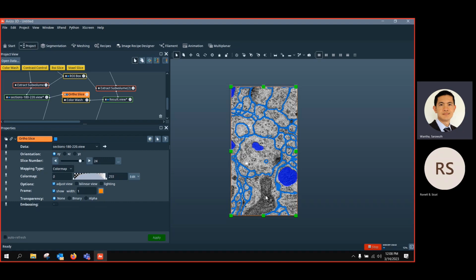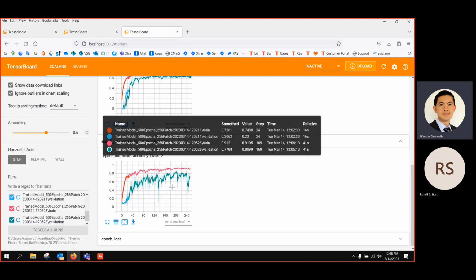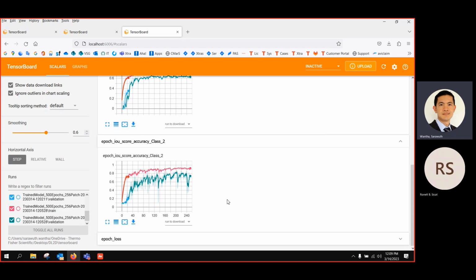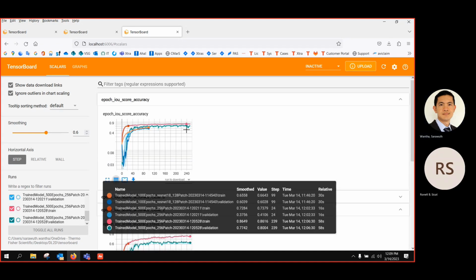That's why when you start training and you look at the TensorBoard, you can see this kind of overfitting or underfitting, where they don't remember the feature because they don't have enough ground truth to really tell, because it's also mitochondria, but you don't segment them. That's why you generate this kind of error on the swing. And then when you average between class 1 and class 2, you get a bit of this swing.